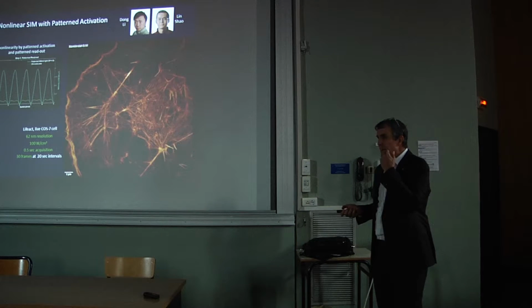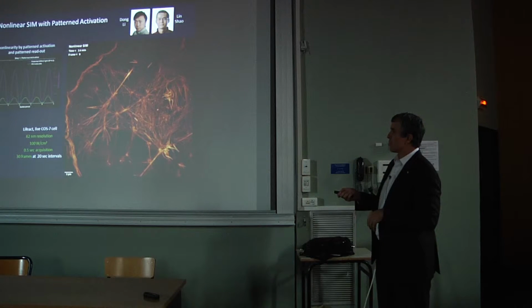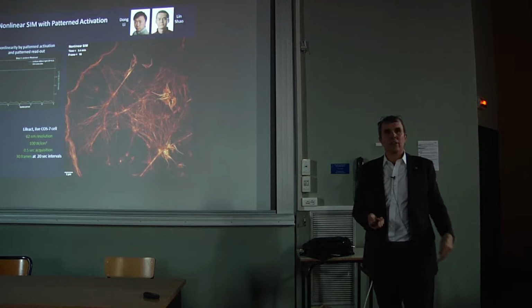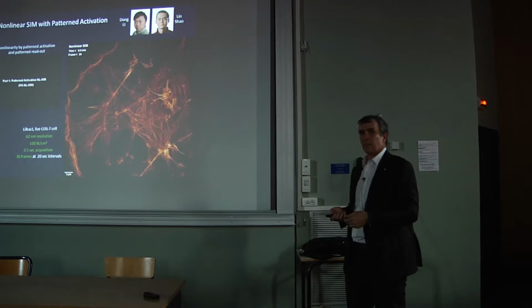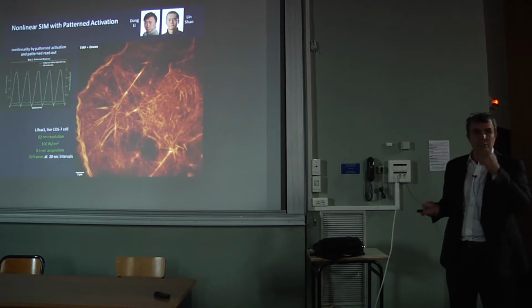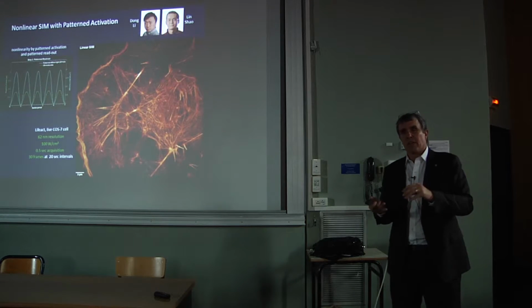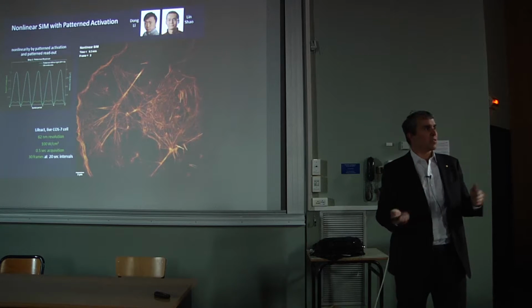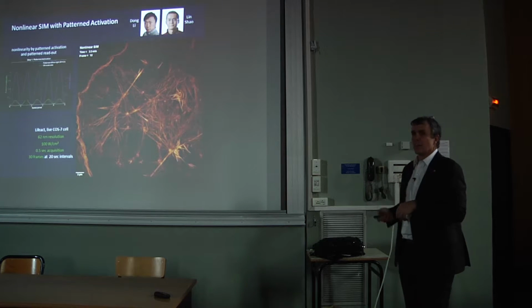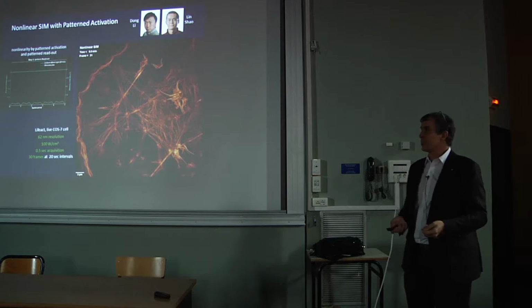So what we developed instead was the idea of, instead of activating all the molecules uniformly, turning on a standing wave of the violet light, which activates a standing wave pattern of fluorescent molecules in the sample, and only a subset of them. And then we turn on a blue light, which reads out the molecules and deactivates them at the same time. And by doing that, we have 2 harmonics instead of 1, and are able to extend the resolution to 60 nanometers instead of 100 nanometers. And so, as this movie's been playing back and forth, you can see as we go from diffraction limited to linear SIM and nonlinear SIM, the gains in resolution as we do that.